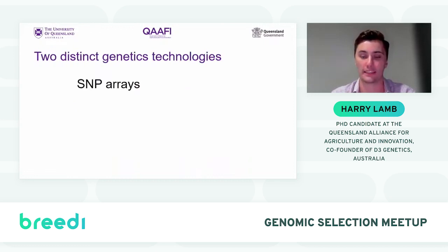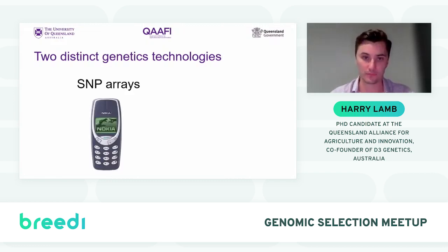When we're talking about getting genotypes, there's really two options we can use. And Breno touched on this earlier in his presentation, but the first technology is SNP arrays. SNP arrays have been around for quite a long time, and they're extremely reliable at providing genotypes for your animals. And they provide extremely accurate genotypes, but they will only do genotypes for the specific positions that we have predefined when we load the DNA onto it. I like to refer to SNP arrays as sort of an old Nokia phone where they're great at what they do, which is sending text messages or making a phone call, but that's about as far as they can go.